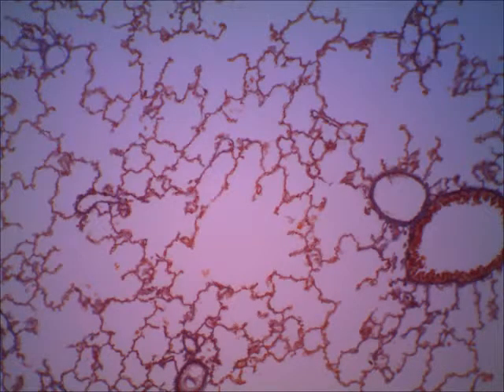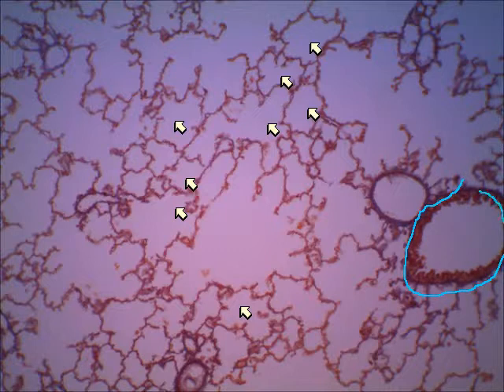Okay, here's on the same magnification. I'll put arrows on these. All of these are alveoli. That's mostly what you see is the alveoli. And then, let's say with blue, I'll circle a bronchiole. That's in blue. And then in green, I'll encircle little blood vessels.